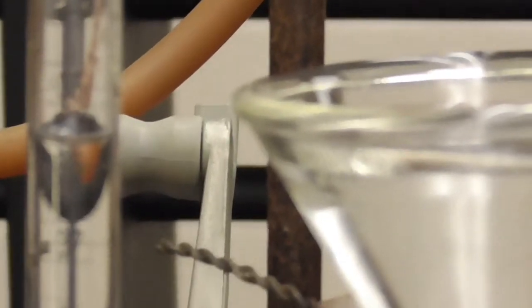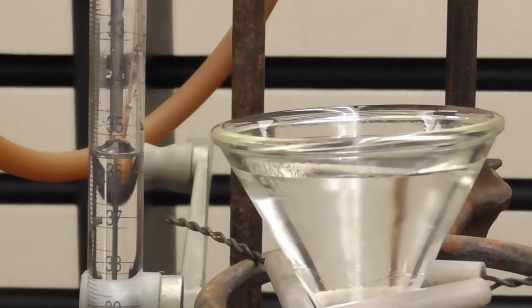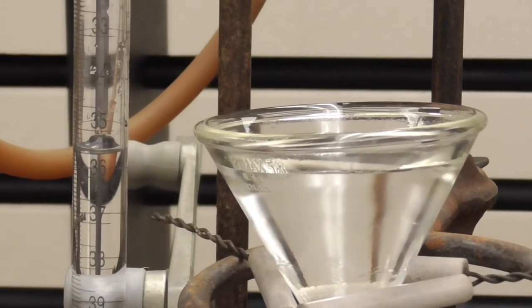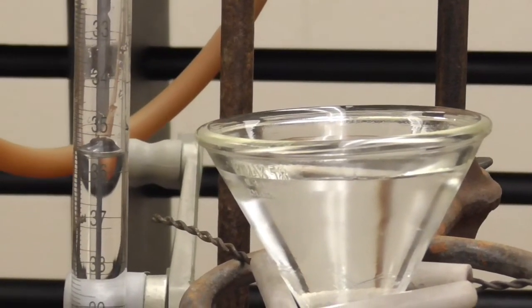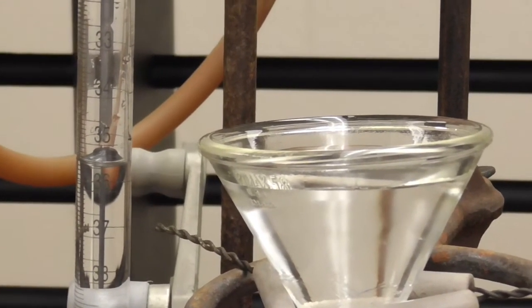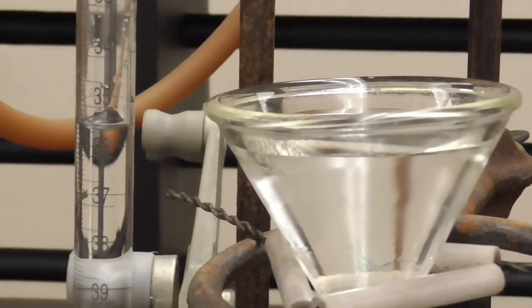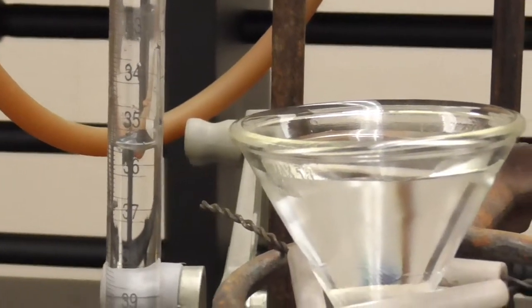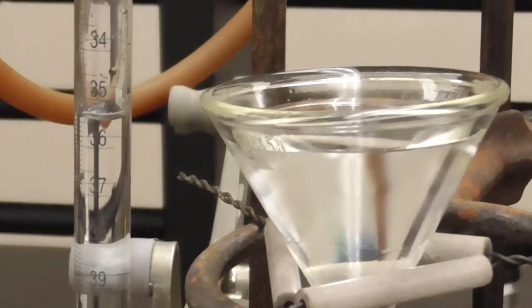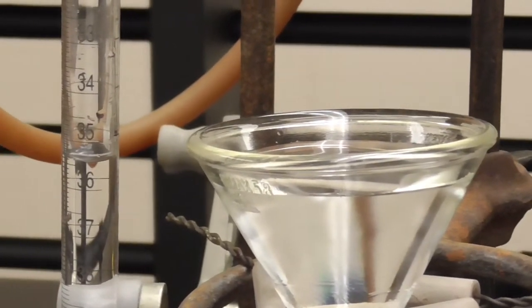Now, what I had forgotten to do in the earlier part of this video was to zoom in on the burette and to actually read the burette reading at that point. I would need to read the initial burette reading and the final burette reading. What I plan to do is run this experiment several more times and generate several sets of data for you to use. So we won't necessarily need to use the data off of this particular run.